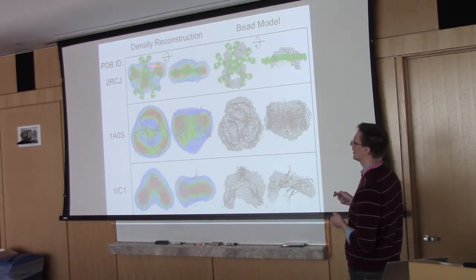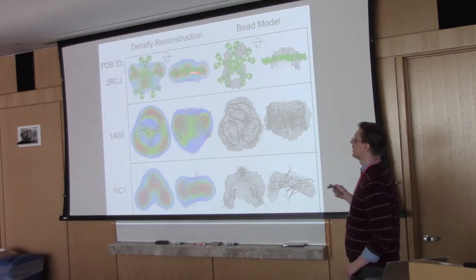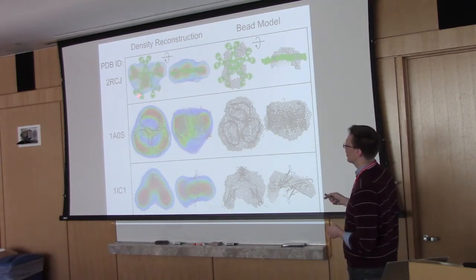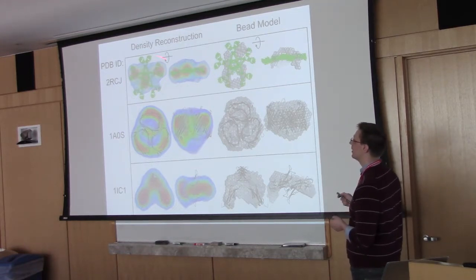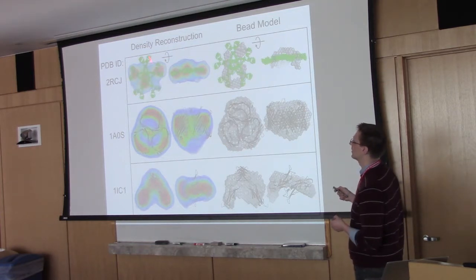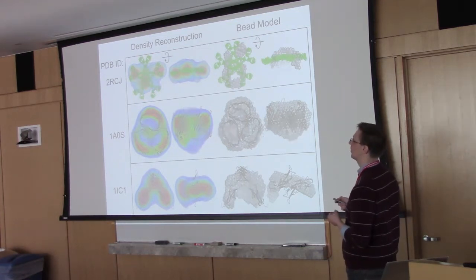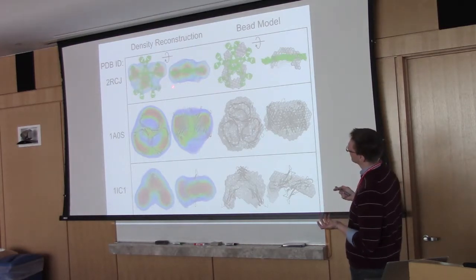So in this case in particular, this is a really, really weird looking snowflake that you can see. It's sort of this very, very flat, almost disc-like profile that's got these immunoglobulin chains, these sort of Y chains sticking out from the center. This is a very difficult thing to reconstruct, and my algorithm didn't do a fantastic job. The reconstructed resolution was something like 100 angstrom resolution, whereas this thing is like 350 angstroms across, right? And so this is a very high axial ratio, and it's got this very intricate structure, very difficult.